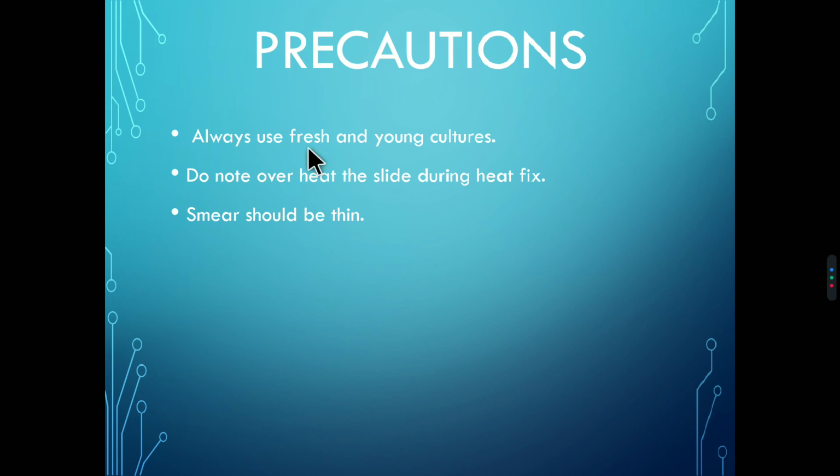These are the precautions. Always use fresh and young cultures. Do not overheat the slide during heat fixing, and the smear should be thin.